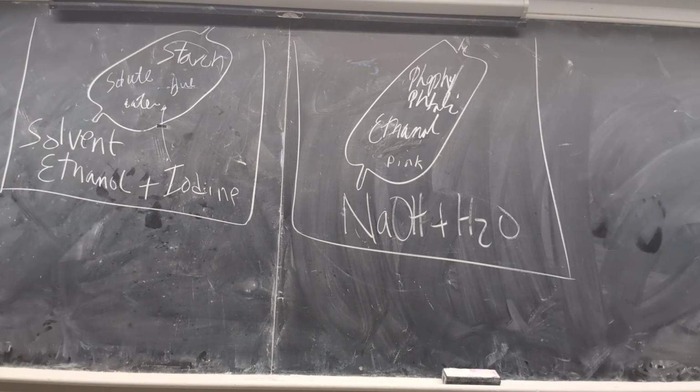Okay, I'm going to show you how to open it. Listen up. Don't worry about opening it for now. This is what you've got to do. Hold on to one end, and everybody who has a dialysis bag, pay attention. Like this, you fold the end up, then make an accordion. Do you know the accordion? Yeah, keep folding it.